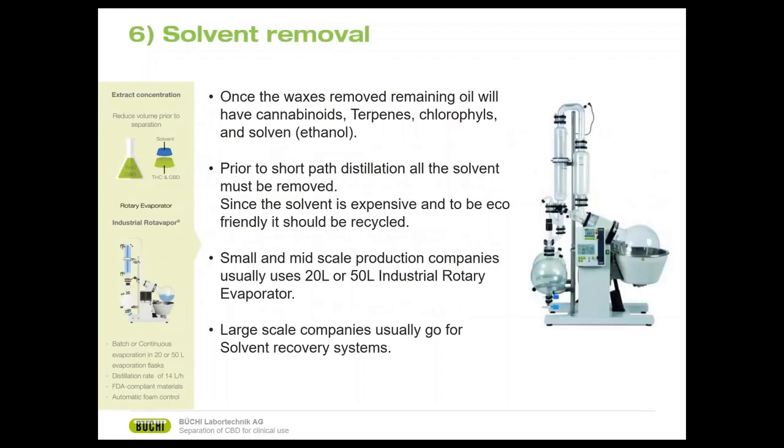So we removed our waxes. However, we mixed our oil with the ethanol prior to winterization. So once the waxes are removed, the remaining oil will have cannabinoids, terpenes, chlorophylls, and solvent, which is ethanol. Prior to short path distillation, all of the solvent must be removed. Since the solvent is very expensive, and to be eco-friendly, it should be recycled. Small and mid-scale production companies usually use a 20-liter or 50-liter industrial rotary evaporator. Large-scale companies usually go for a solvent recovery system or multiple industrial rotary evaporators.